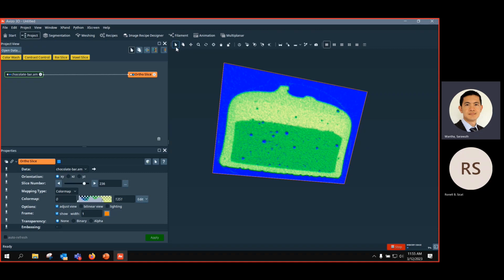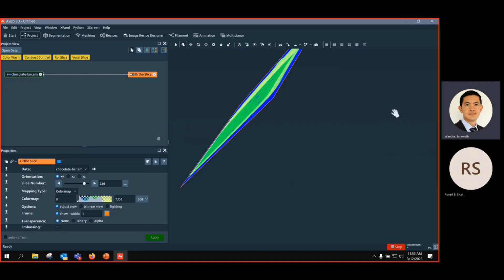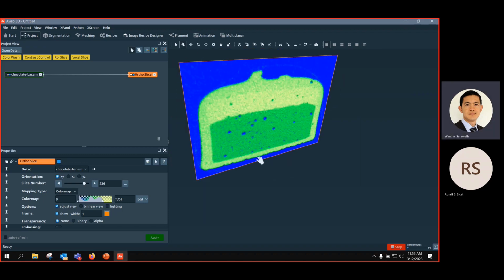So if you switch from arrow to trackball, then you cannot interact with them, but you can move them around using this trackball here, for example. And there is a shortcut on the escape key, ESC, to switch between these two. You can see that between these two, you can press the escape key on the keyboard. So you can switch between hand tool and interact tool, between trackball and interact.